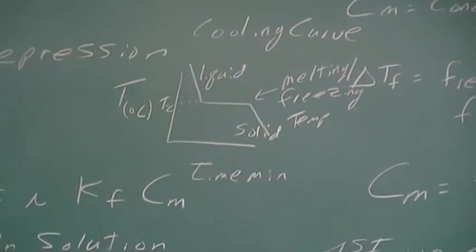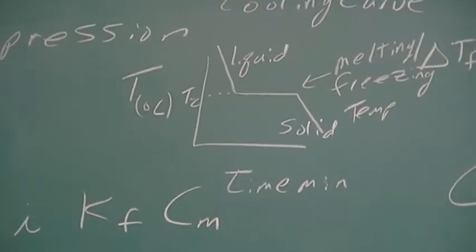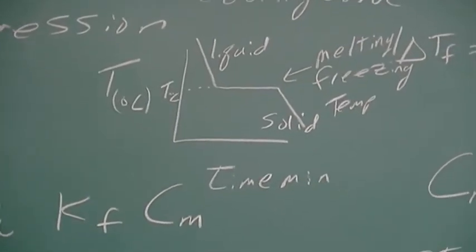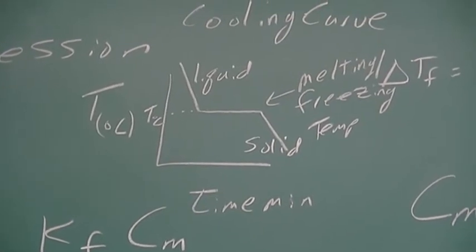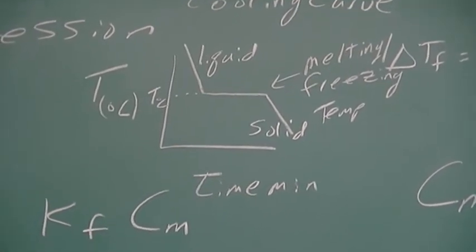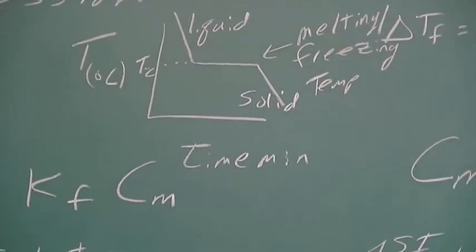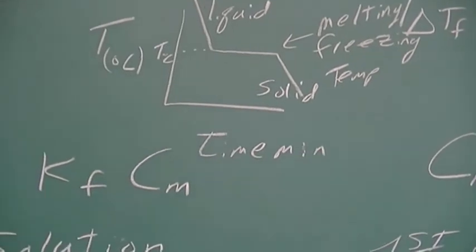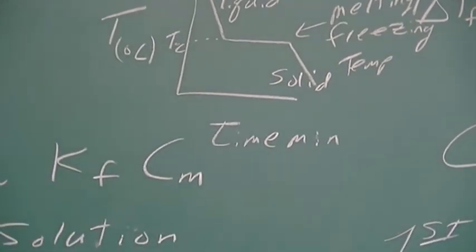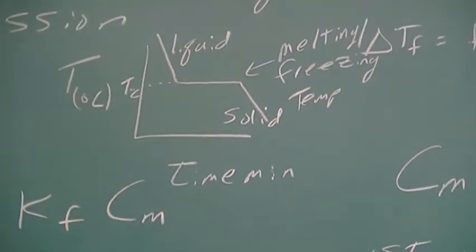All right, so we're going to have a graph. And so we're going to graph the temperature versus time. And so you see this cooling curve. So you have your liquid at the higher temperature, and the temperature lowers over time. And then what we should see is a leveling out of the temperature. And what's happening here is the liquid is freezing. All right, and then once it is frozen, it is then going to cool down to the temperature of the ice bath.